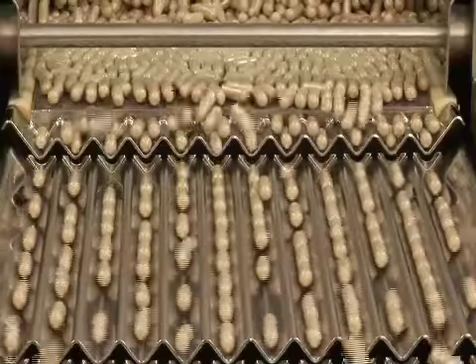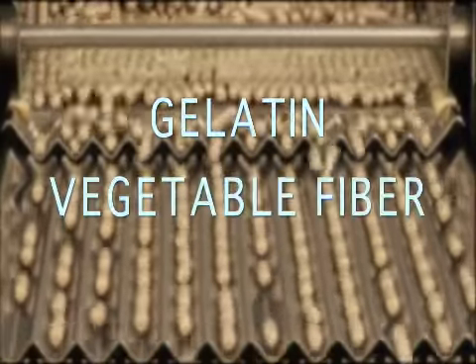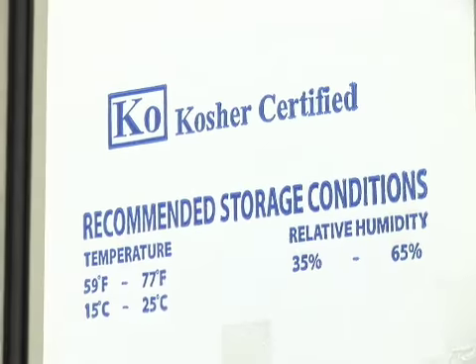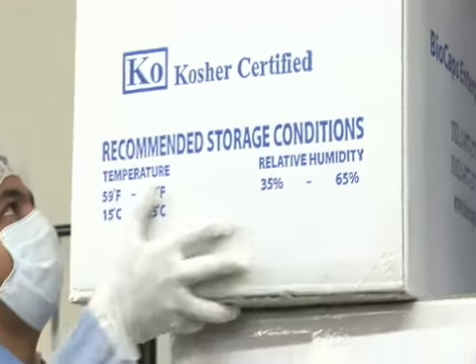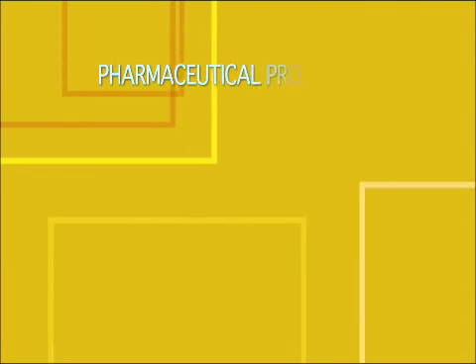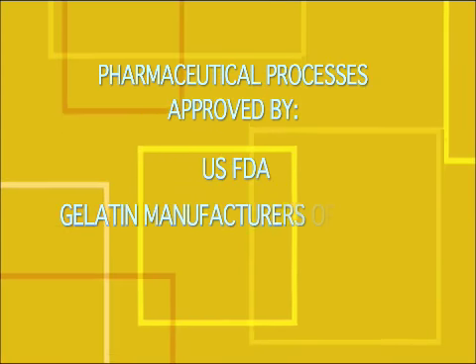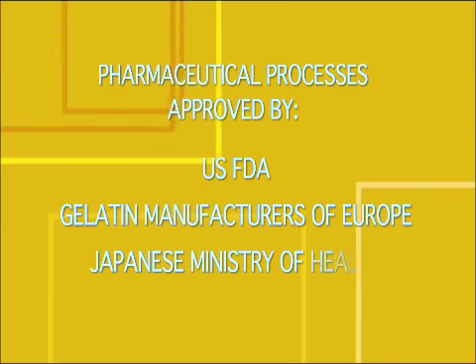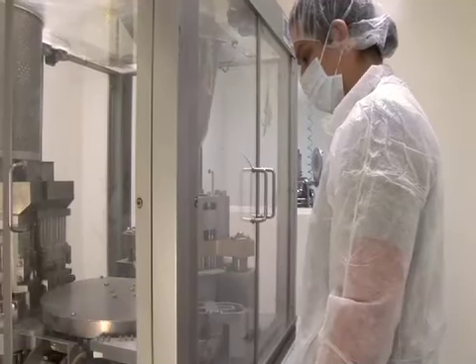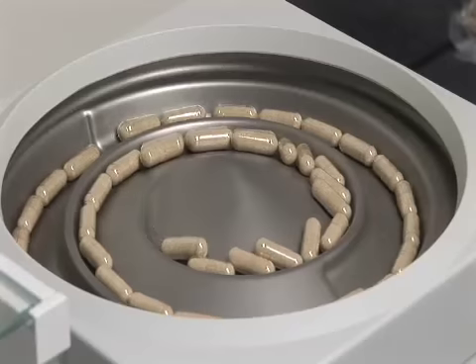We use two types of capsules, made either from gelatin or vegetable fiber. Both types are kosher certified. This means that they are manufactured under strict hygienic controls. The gelatin has been produced using pharmaceutical processes approved by the US FDA, the Gelatin Manufacturers of Europe, and the Japanese Ministry of Health. During the encapsulation process, the machine operator continuously checks capsule weights.